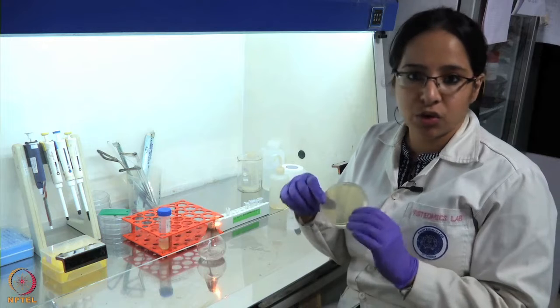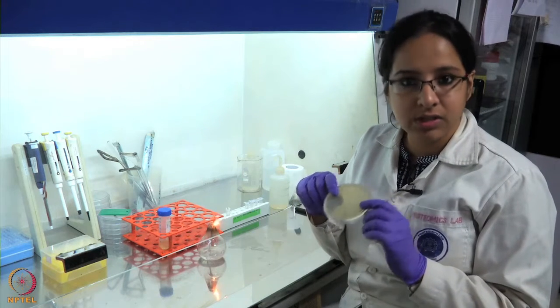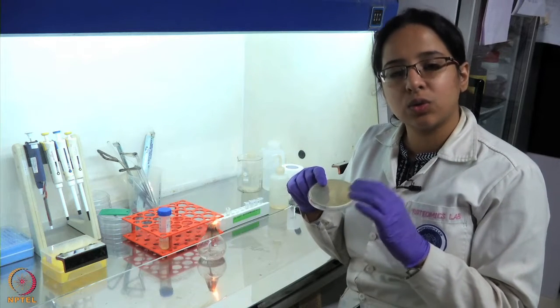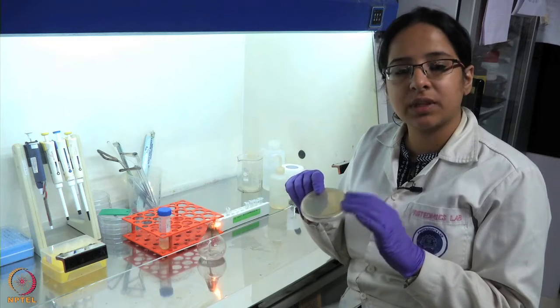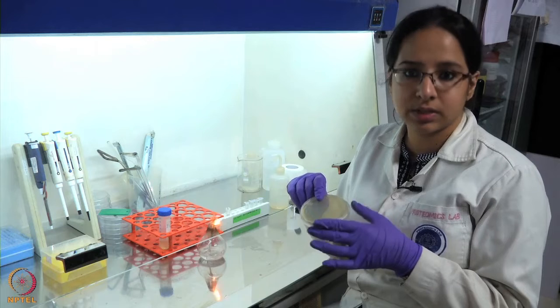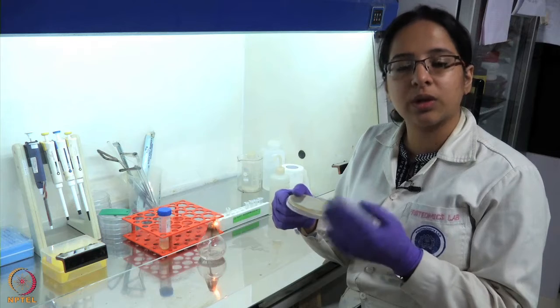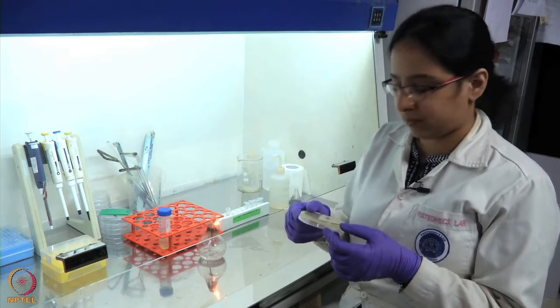One thing we are sure of is that there is no insert-only colony here, because the vector has an antibiotic resistance gene, and here in the media we have our antibiotic ampicillin. So only those colonies which have the vector will grow on these. Now those colonies can be the self-ligated vector or they can be the recombinant molecule having the insert. For that we'll take these colonies, grow them, isolate the plasmid and check their size.